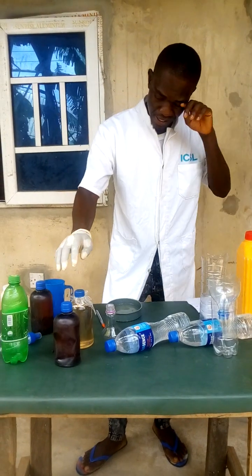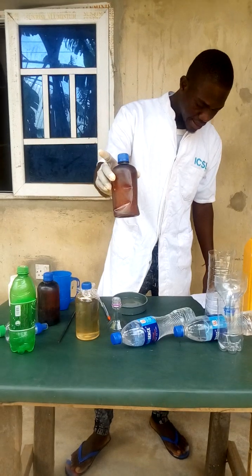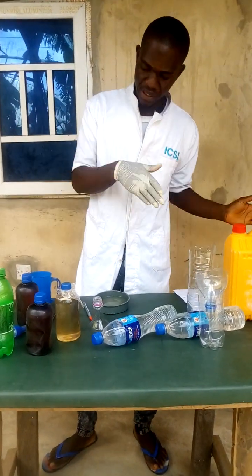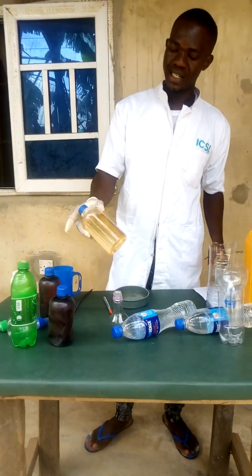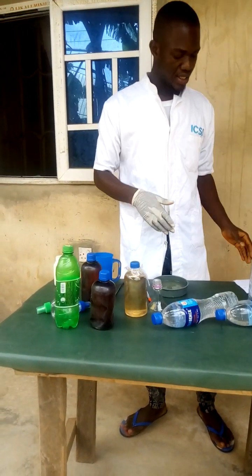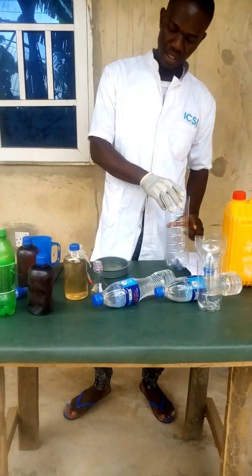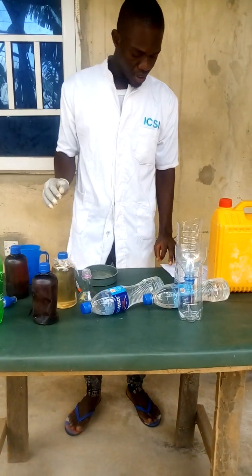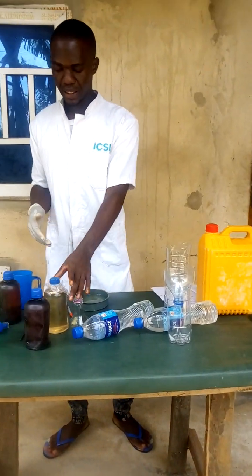So because I have this, I'm going to be measuring 1000 ml of this to 20 ml. It should be 19.29, but I approximated it to 20 ml of glycerol. Remember, I said the glycerol, you don't need it so much. It's just for skincare, right? So you don't need to pour the whole thing into the solution. Or if I am reducing it to 500, if I'm using 500 ml of this, that means I'll be needing approximately 10 ml of the glycerol.